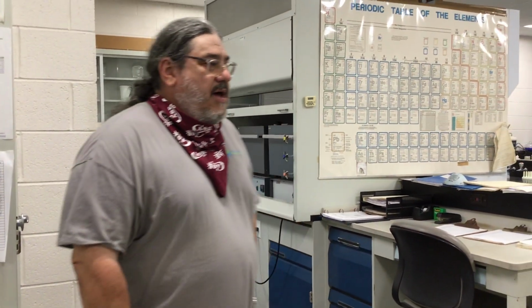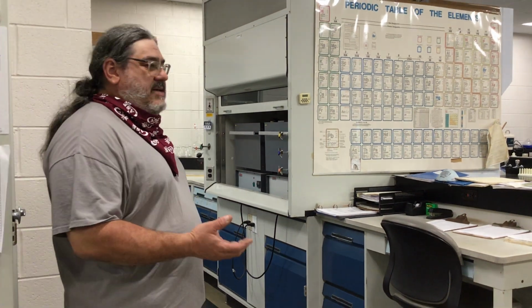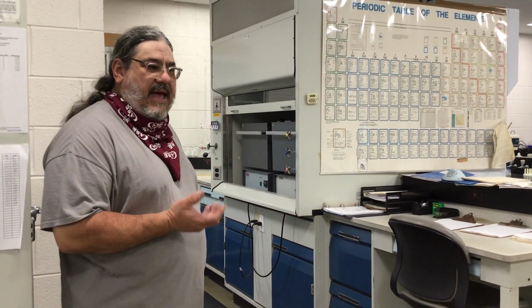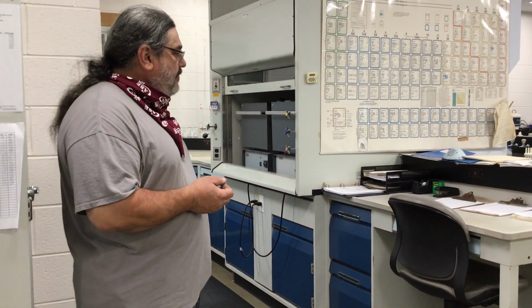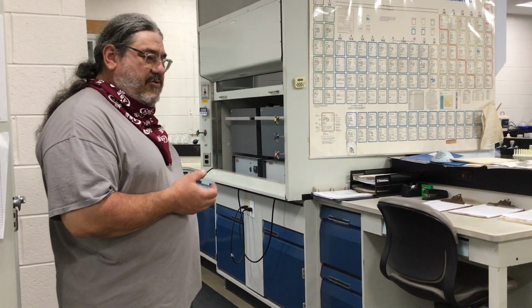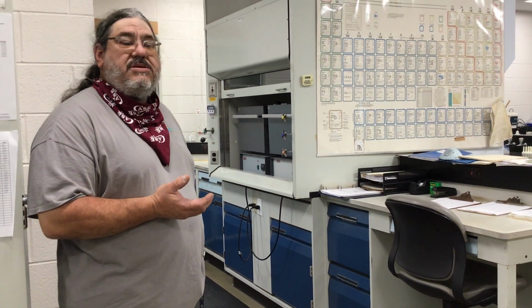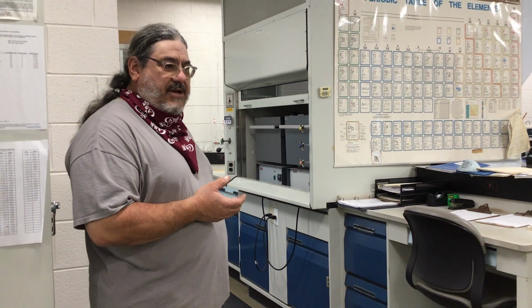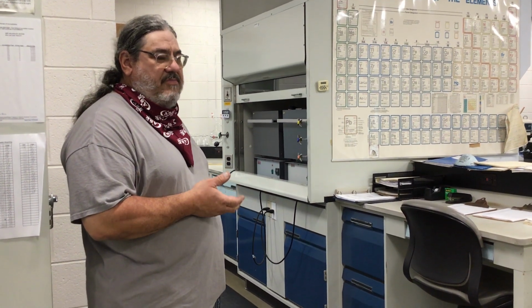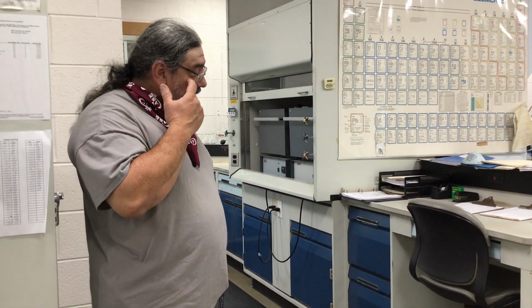We have a permit that's issued by the state called an NPDES program, and in that program we have certain limits that we have to meet as far as effluent quality. So that would be compliance testing. Again, there's a lot of solids testing, and that's BOD testing, biochemical oxygen demand. So we have limits for those two parameters, also for pH, dissolved oxygen, fecal coliform. This is where we do a lot of our nutrient testing, both for nitrogen and phosphorus.